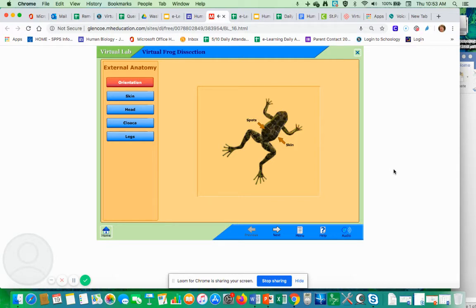Leopard frogs are named for the dark spots on their dorsal surfaces. The bottom or ventral side is usually a solid color. This coloration pattern helps to camouflage the organism both in and out of the water.